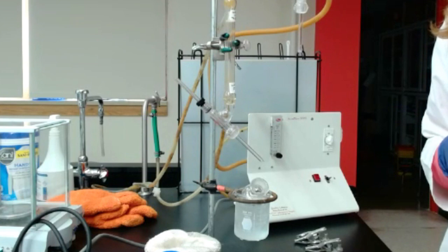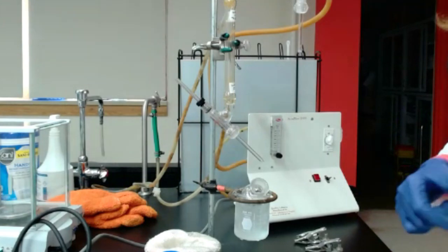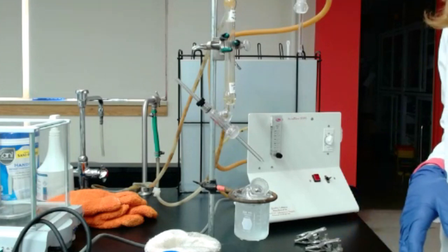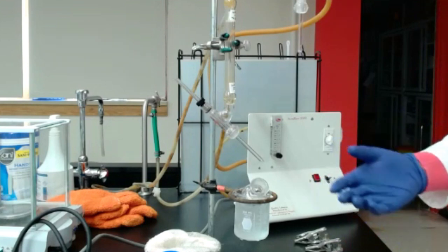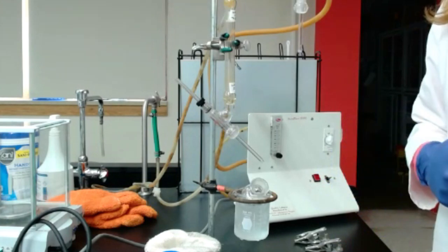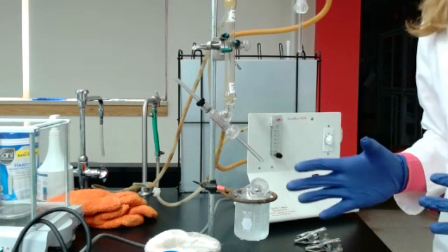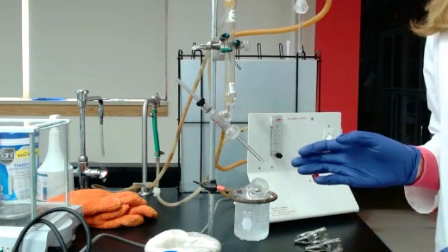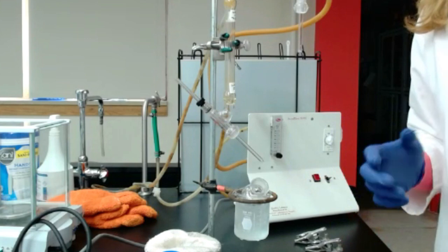Also, make sure you read the safety data sheet for all the chemicals you're going to use. That's really to make sure you know what to do with those wastes, because some chemicals you can combine, some you cannot combine, because they are so reactive that they could explode in the worst case scenario. So just make sure you follow those safety data sheets. And also make sure you don't put everything in your sink. That's to protect the aquatic life and to protect everybody. If that's just wine, you can put that in the sink. But if it contains hydrogen peroxide or sodium hydroxide or phosphoric acid, don't do it, please.